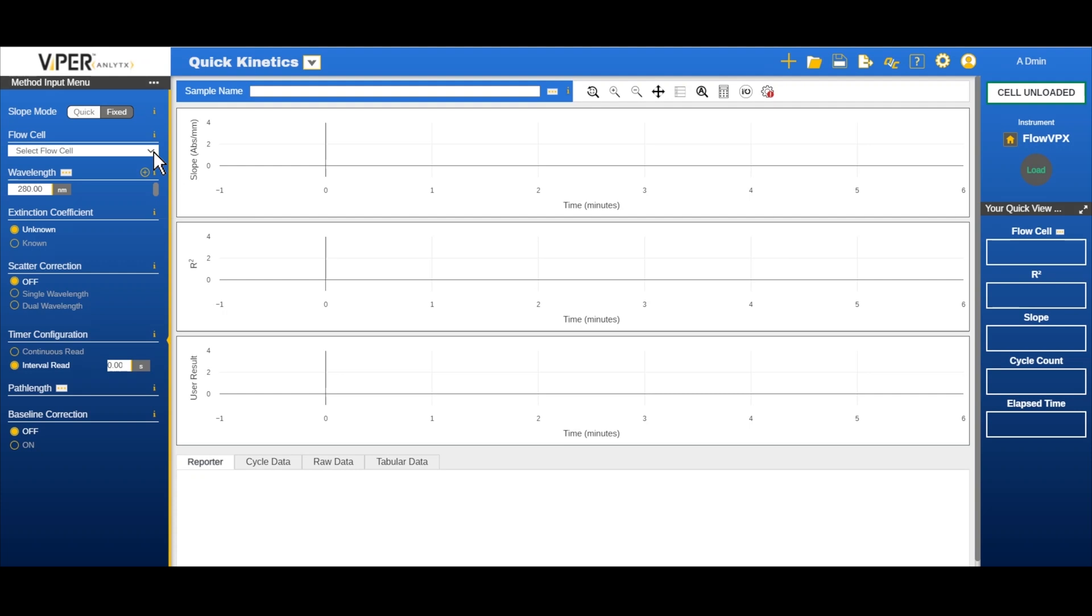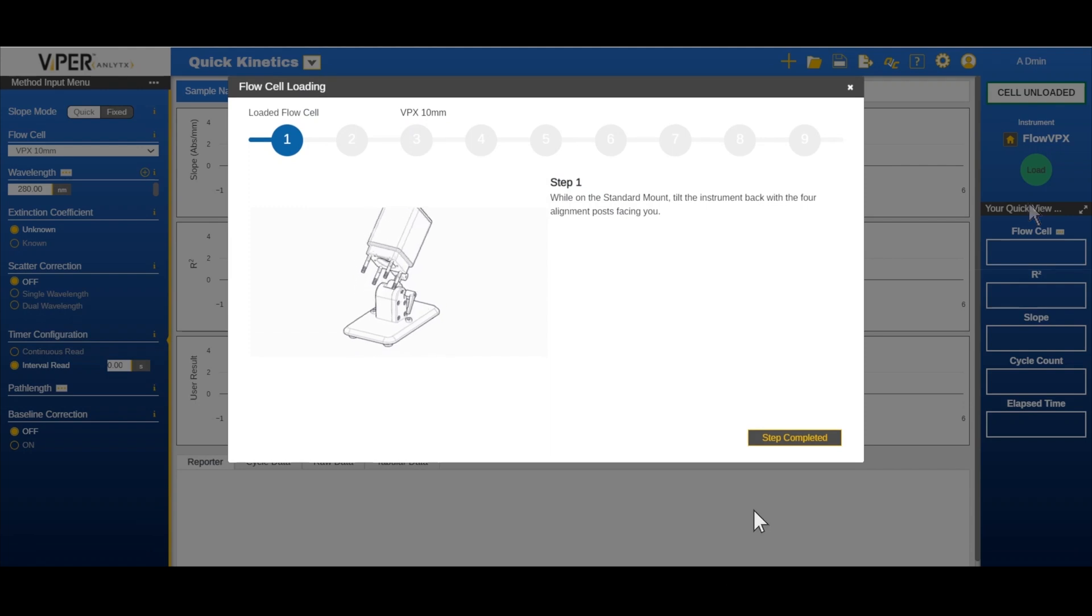Click quick kinetics to launch the application. Select the flow cell from the drop down method input menu. For this video we will be selecting the 10 millimeter flow cell. Click the load button from the instrument control menu. Follow the steps prompted on the screen, then click step completed to proceed.